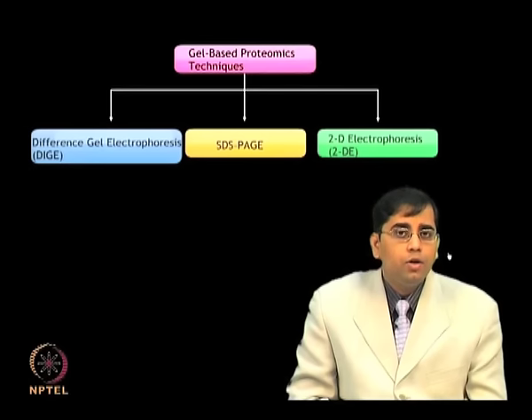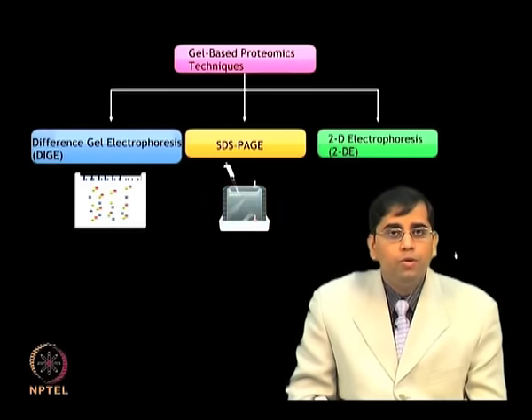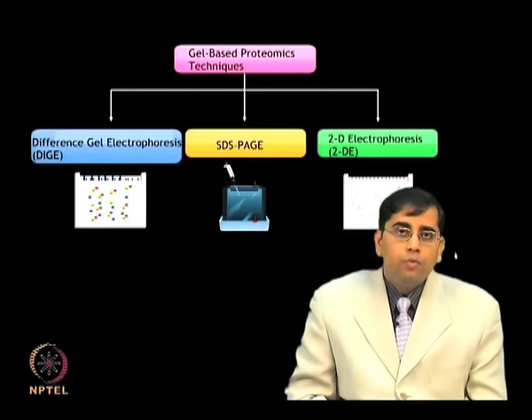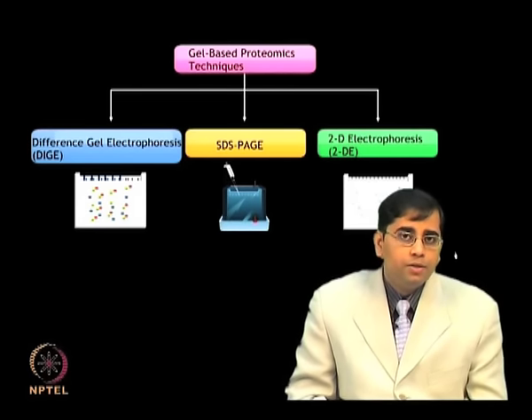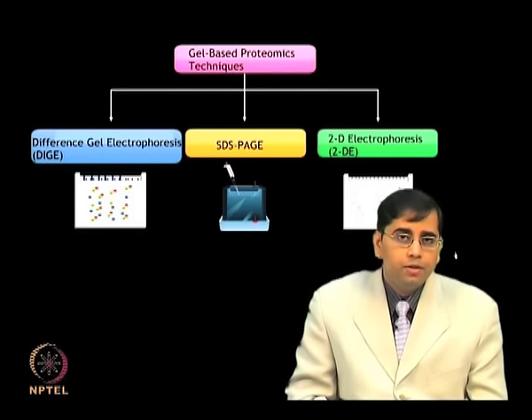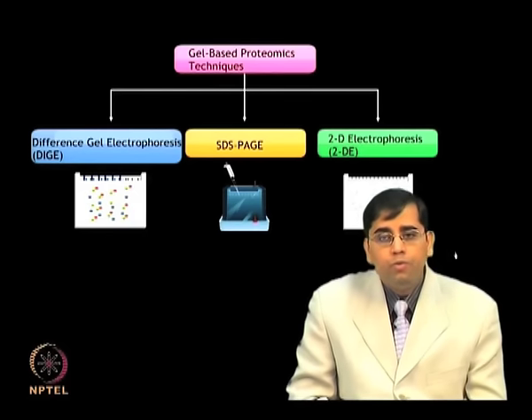Separation in SDS-PAGE occurs almost exclusively on the basis of molecular weight, whereas in 2DE the first dimension separation is based on isoelectric point and the second dimension separation is based on molecular weight.